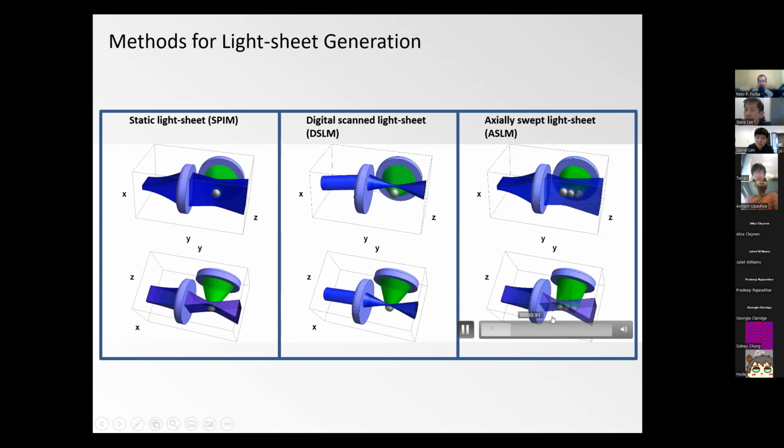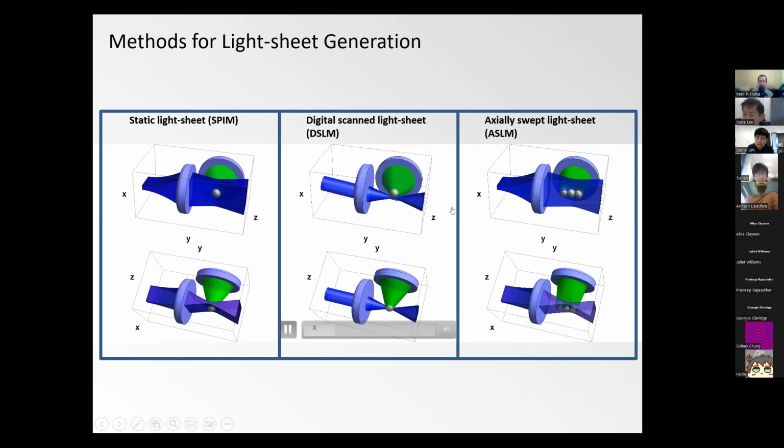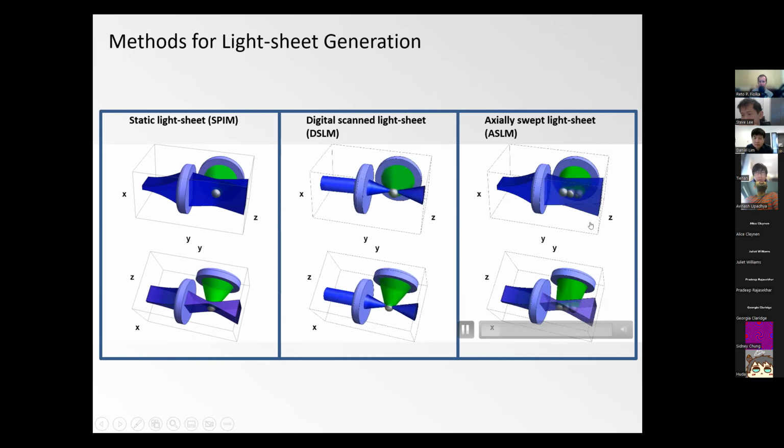And then lastly, you can also create a SPIM light sheet and actually scan it in the orthogonal direction. So essentially scan it in the direction it propagates, which would be here, I think the Y direction. But as you can see, here maybe in the cross section, the sheet moves here from left to right. And this is sometimes called the axially swept light sheet, or also the tiling light sheet. So I think these are the three forms that are predominantly used to create light sheets. And as I mentioned, there are by now over 100 different techniques. And I'm guilty as charged. We also coined a few acronyms in that field.